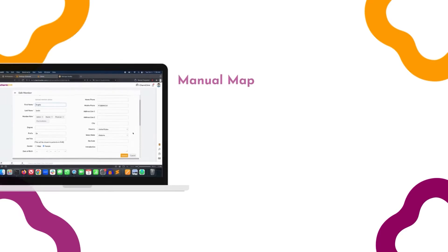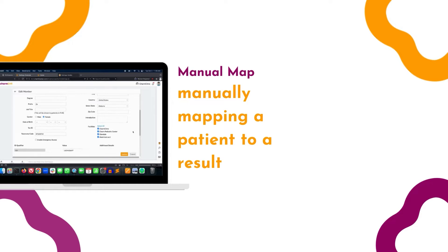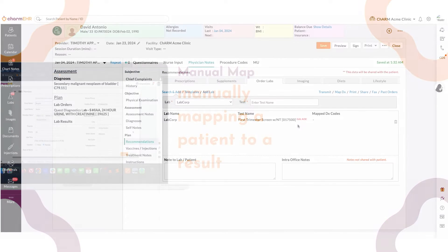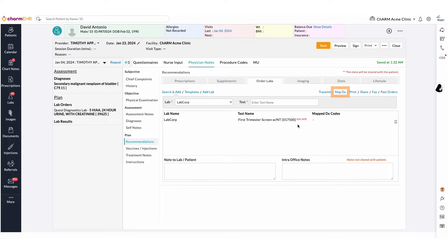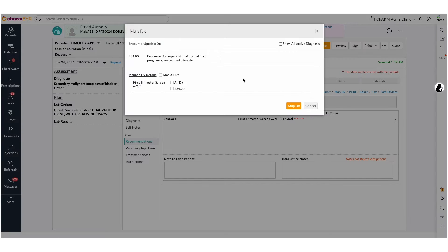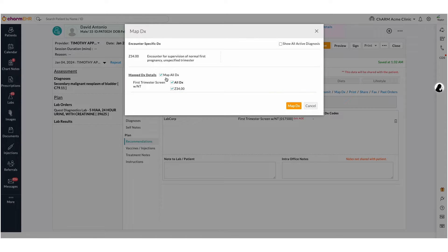Map DX codes. Once you have ordered the lab tests, you have to map the patient's active diagnosis to lab orders using the Map DX option. The Map All DX checkbox can be used to map all the active diagnosis of the patient to all the tests. Diagnosis can also be mapped on a test-specific level.